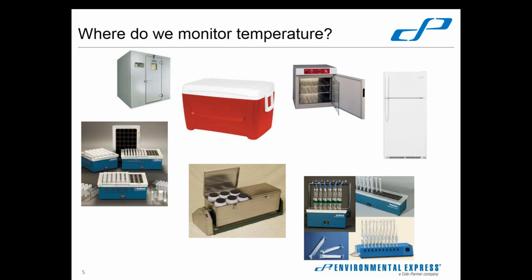But we've got sample storage, sample transport, and a microbiology type incubator. We've got digestion blocks. TCLP, I remember the first time I learned about TCLP was, it was not done in the department that I worked in, but I heard about an audit finding where the temperature was not monitored for our TCLP rotators. So we had to get a conditioned room where we could monitor the temperature constantly. Distillations, lots of different pieces of equipment, lots of different places, lots of different types of things that we need to monitor our temperature in.